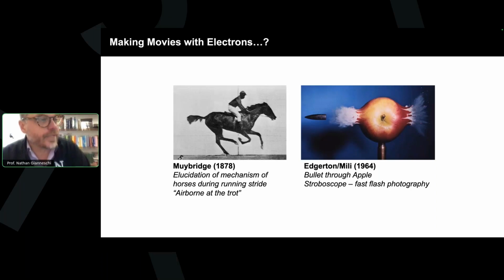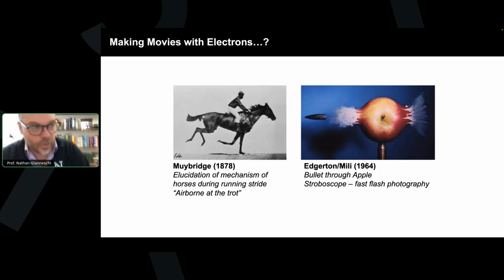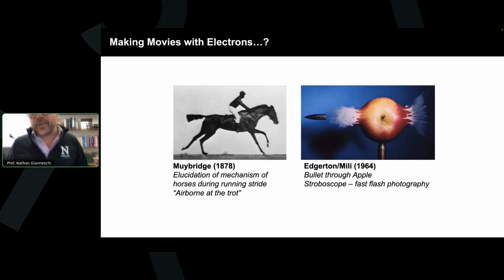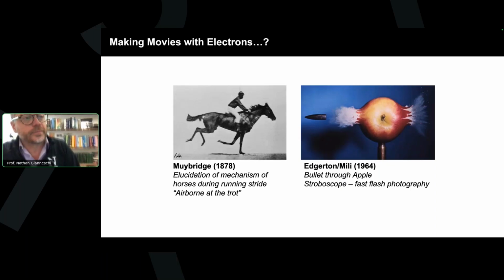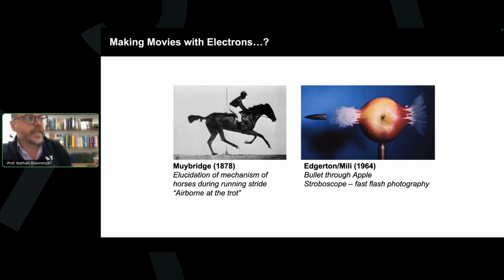On the right-hand side is another example, not of a movie, but of a flash photograph of a dynamic process. Of course, in this mode, under flash, stroboscopic-type photography, the exact arrival time and then exit time of that bullet is known. And so with some technology around cameras and shutter speeds, you could take images like this and many others like it. So what we'd love to do is something between both of these, or maybe both at the same time, but for unknown chemical systems at the nanoscale, which presents a lot of challenges.